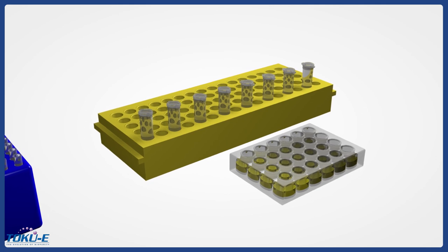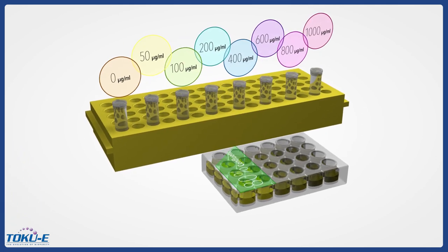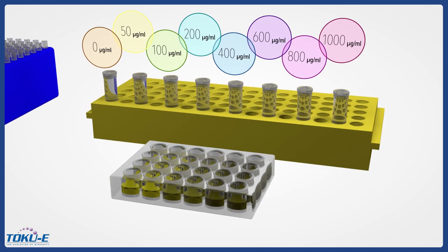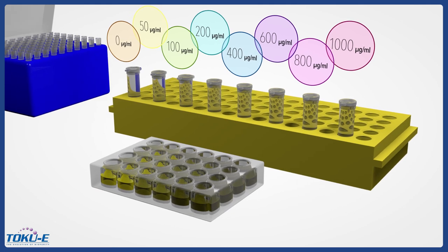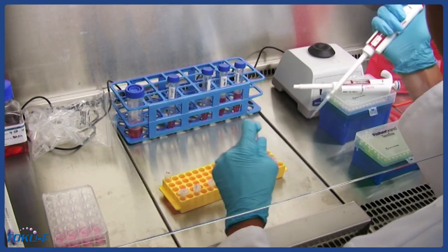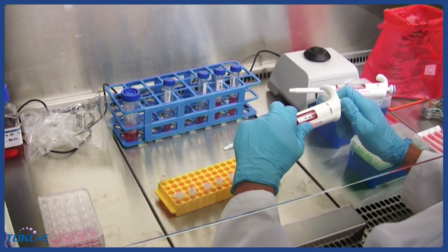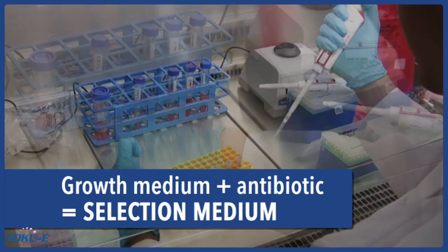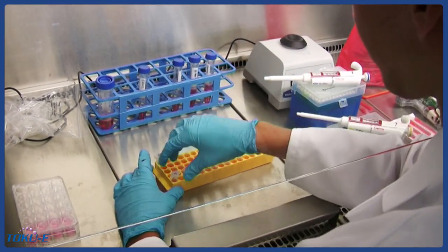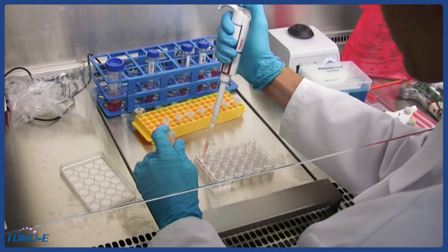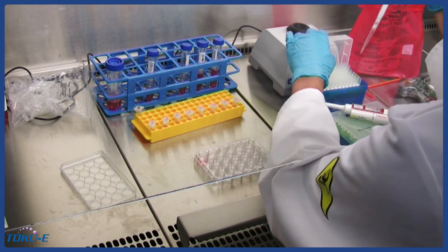The day after seeding, we will add the selection antibiotic at 8 different concentrations to the 8 wells with 80% confluency. For G418 disulfate and our CHO cells, we will use 8 different concentrations from 0 to 1000 micrograms per milliliter. This concentration range will vary depending on the type of selection antibiotic and cell lines used. Prepare 8 microtubes containing 500 microliters of culture medium and each of the 8 different antibiotic concentrations. The growth medium containing the selection antibiotic is called a selection medium. Vortex each of the 8 tubes. Remove the medium from each of the 8 wells in the 24-well plate and replace it with 500 microliters of each of the 8 selection medium concentrations to the corresponding 8 wells.